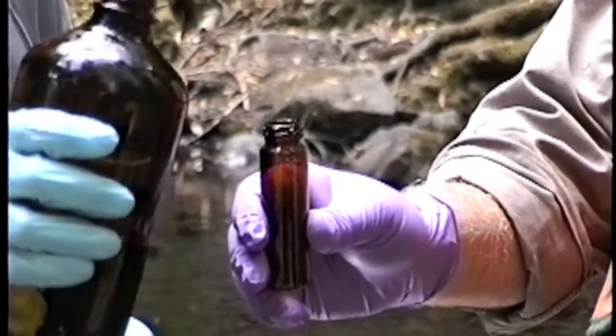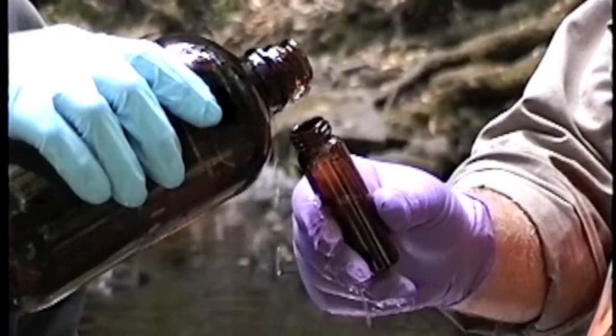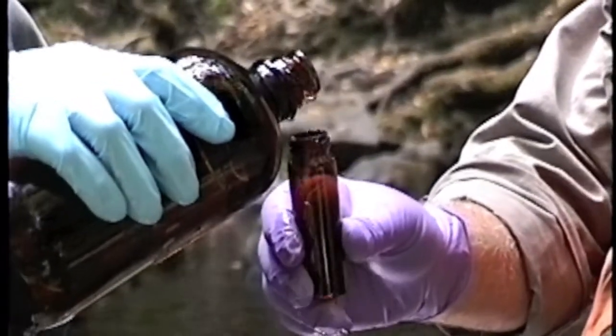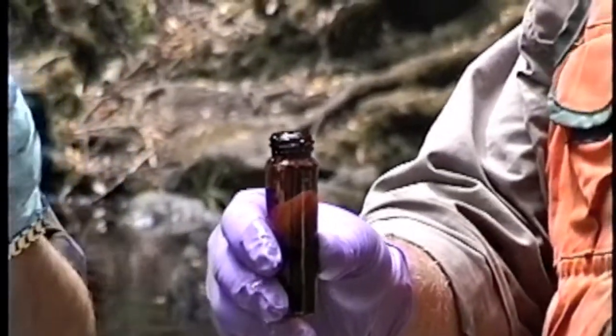We then pour the sample into the VOC vial, making sure that we don't pour any excess water over the side, pouring a meniscus on the top.